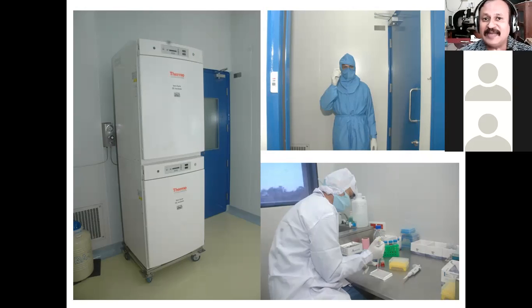And not only that, but interestingly, these are self-locking doors, automatic locking doors. So in fact, what happens is when he comes inside through this door, while this door is open, he cannot open the second door. When one door is open, the other door cannot open. It will remain locked. Only when the first door closes properly and it gets locked, then the second door will open. Why is that there? That is to prevent any contamination.